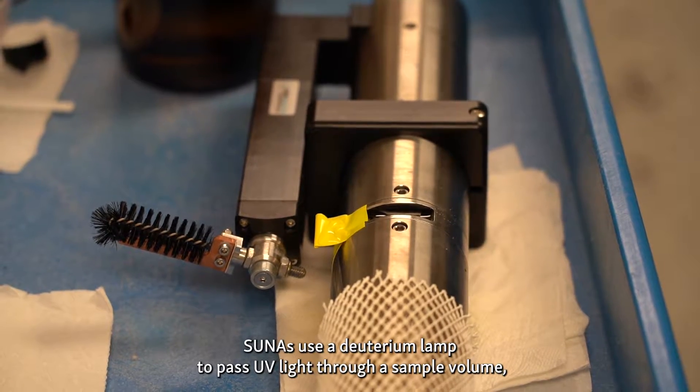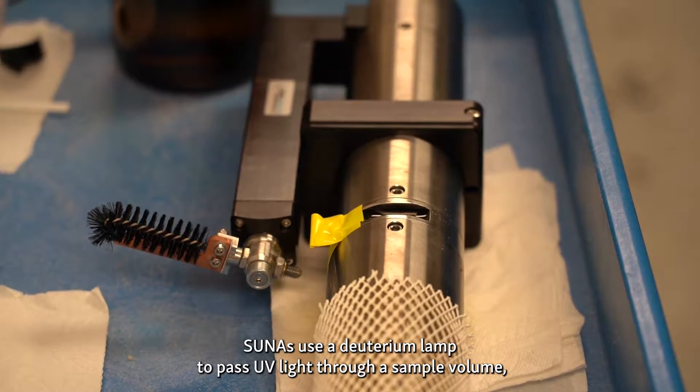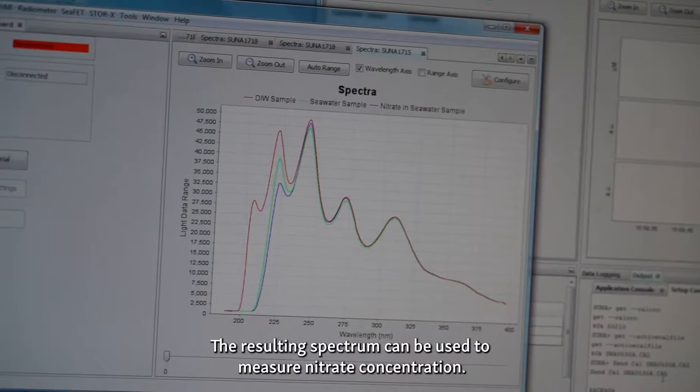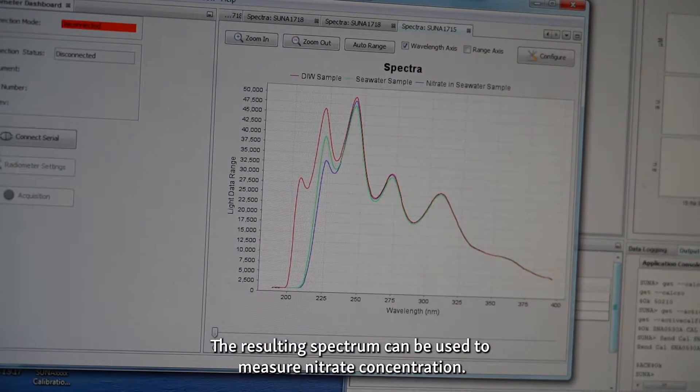SUNAs use a deuterium lamp to pass UV light through a sample volume, which is picked up by a spectrometer on the other end. The resulting spectrum can be used to measure nitrate concentrations.